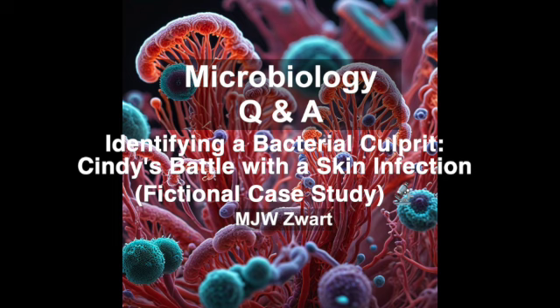So this is where the real detective work begins. We're moving from a visible wound to the invisible world of bacteria. Now what can we learn just by looking at bacteria under a microscope? Well, different bacteria have their own unique characteristics, kind of like how we all look different. They come in various shapes and sizes, and they even have preferred ways of grouping together. Some are loners, some form chains, and others cluster together. So it's kind of like their own unique fingerprints, and we can use those characteristics to identify them. You got it. Just by observing these visual clues, we can begin to narrow down the possibilities.